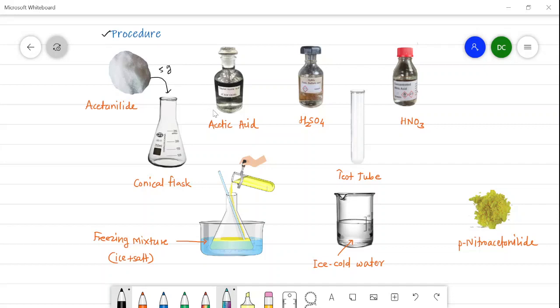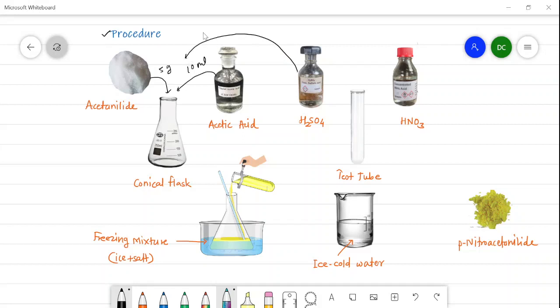First of all, 5 g of acetanilide is taken into the conical flask. Along with this acetanilide, glacial acetic acid is added — the amount is 10 ml. Glacial acetic acid means it contains less than 1% water, whereas regular acetic acid used in the laboratory contains more than 1% water. Along with this, 10 ml of concentrated sulfuric acid is added. So this conical flask contains 5 g acetanilide, 10 ml acetic acid, and 10 ml sulfuric acid, and is then kept in the freezing mixture.